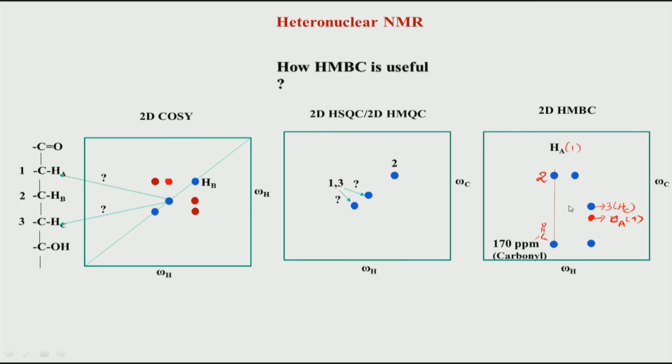Okay. If I get information from this carbon, that is this CHCOH carbon, good, that will also help me to resolve the doubts between HC and HA. For example, HC will give me a correlation to this carbon, but HA will not. So yes, having this information also helps, but I am already able to clarify my doubts by simply looking at the carbonyl correlation.